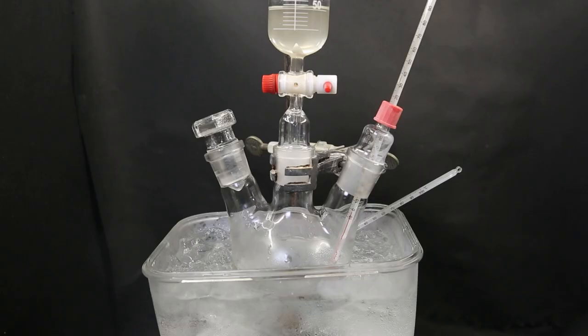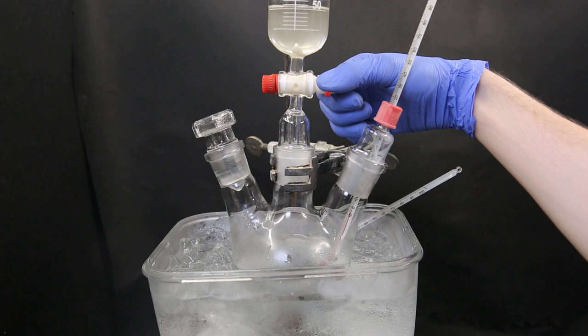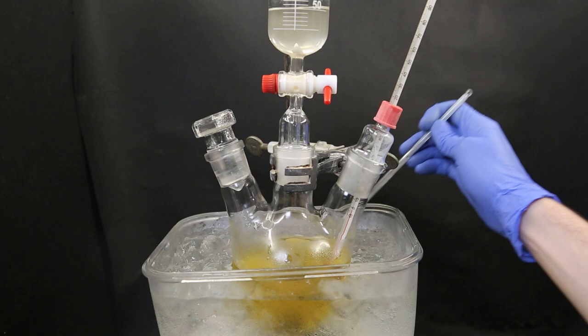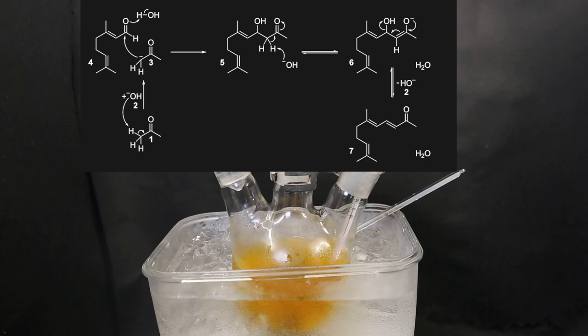When adding the sodium ethoxide, the solution quickly discolors. It is important to keep the temperature around minus 5C or below to reduce any side reactions or polymerization. What is happening is a base-catalyzed aldol condensation between citral and acetone, followed by dehydration of the aldol product into pseudo-ionone.